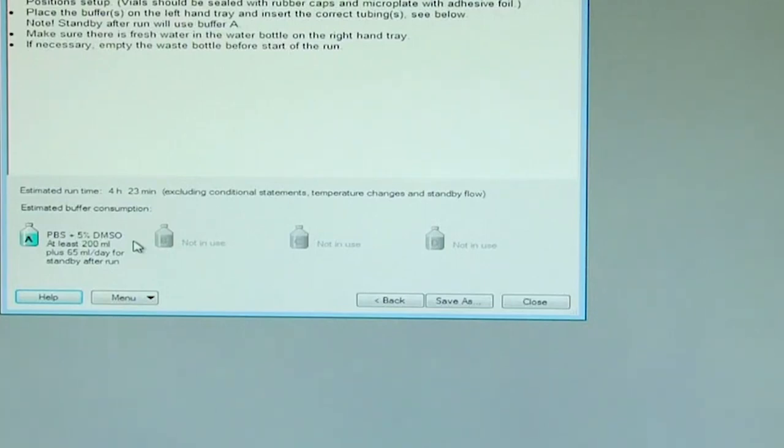Preparation of the running buffer, preparation of the samples, checking for the solubility, checking for the aggregation is very important when we set up our small molecule interactions. Immobilization level should be high. The machine should be cleaned, or desorbed, at least one day prior. The instrument should be equilibrated with the running buffer for at least 6 hours before the start of the experiment.